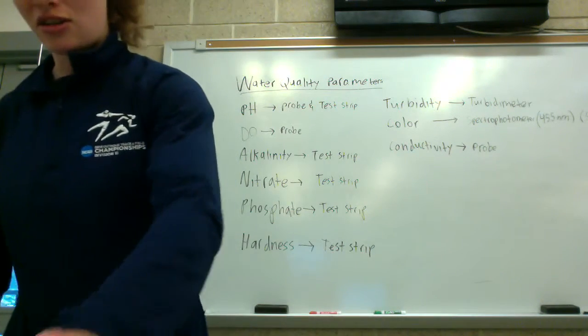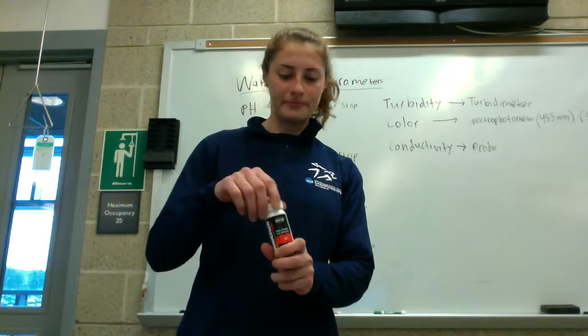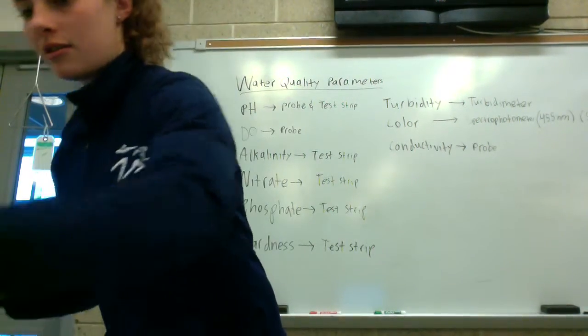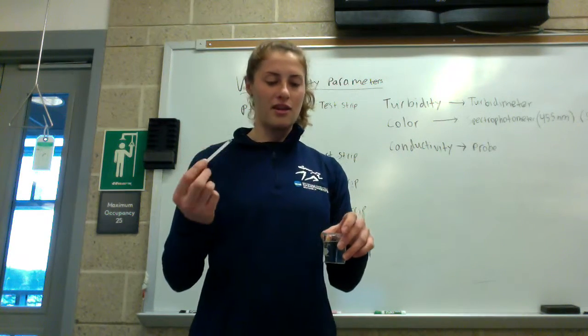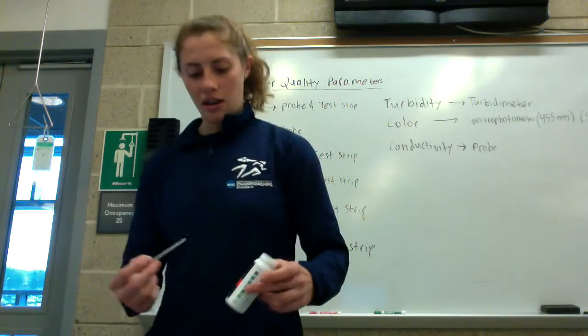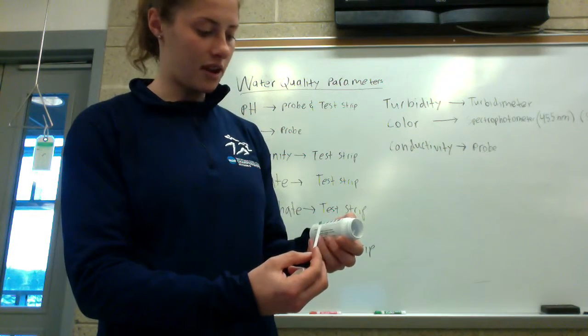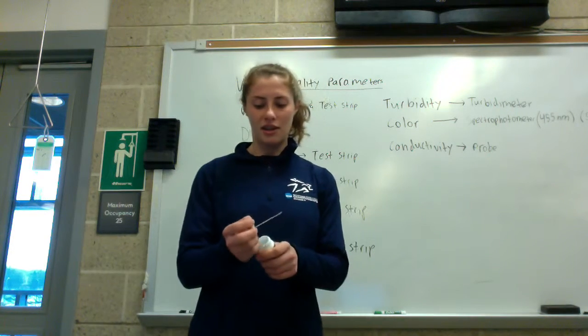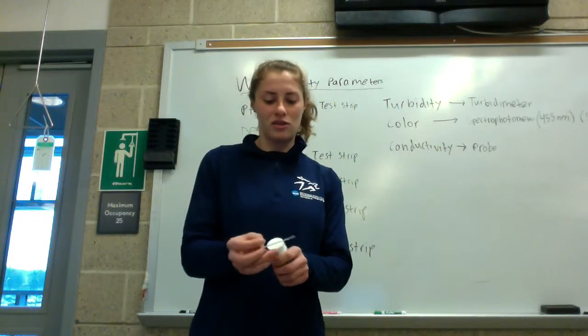To measure pH you can do it two ways. The first way is using test strips. Take a strip and dunk it in your sample, remove it immediately, and wait about 15 seconds for it to change colors. You can use the bottle to compare the color. A pH of around 6, which is less than 7, indicates it's acidic. pH greater than 7 indicates the solution is basic.